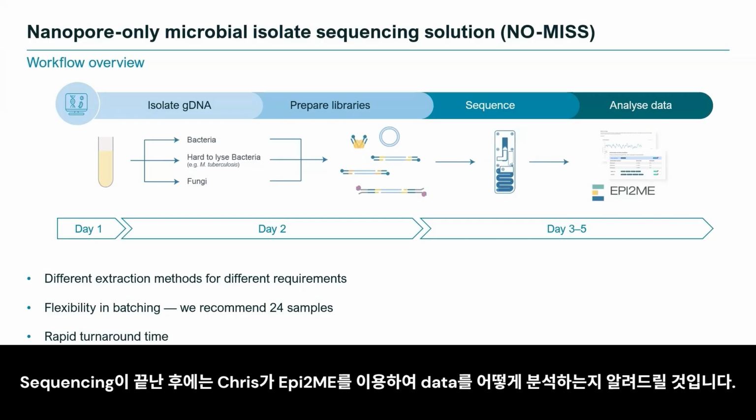Now, after that sequencing, Chris is going to walk you through how we're going to analyze that data using EPI2ME.